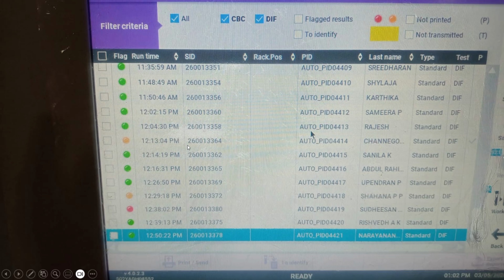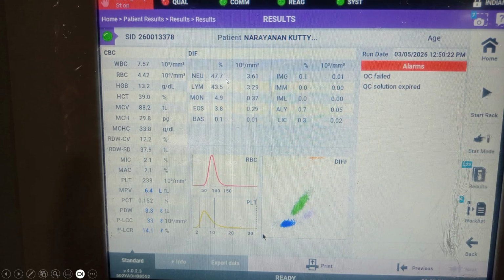Without the knowledge of that, it will be very difficult to identify the patient. So the request number or the lab number is a must to identify which patient's reports you want to check. Okay, so you click on that, immediately the reports will open, and as per that you can identify what report is required, whether any extra tests are required for that particular patient or anything that has been asked, you can find out. Okay, hope you are able to understand this. Thank you.